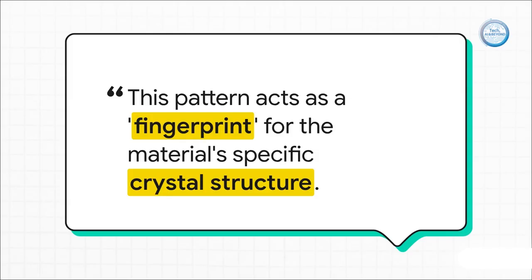This quote mentions getting a unique fingerprint for it. This quote is talking about one of the oldest and most powerful techniques we have, X-ray diffraction, or XRD. Its main job is to determine a material's crystal structure. Most solid materials are crystalline, meaning their atoms are arranged in a nice, orderly, repeating 3D pattern.